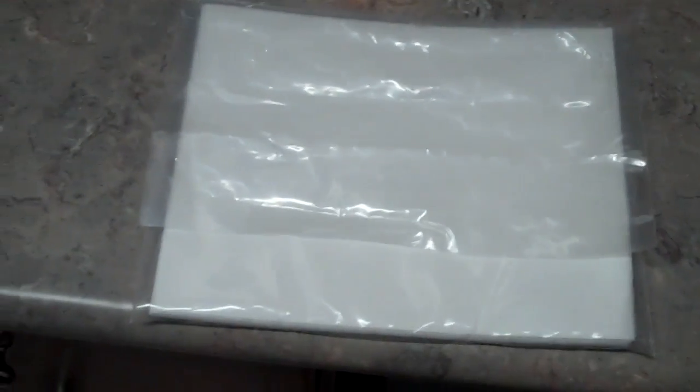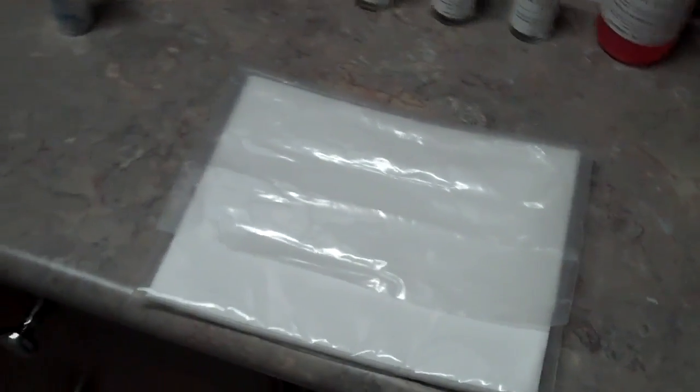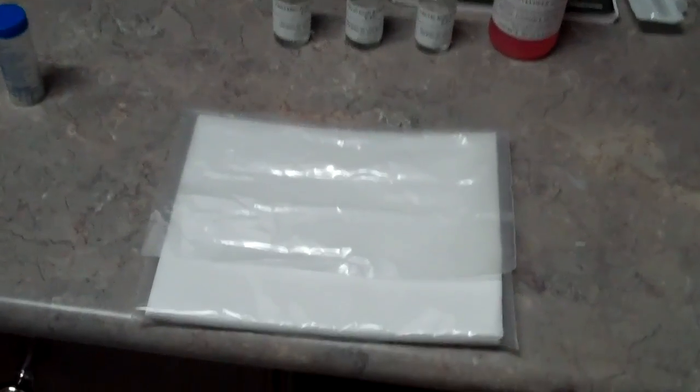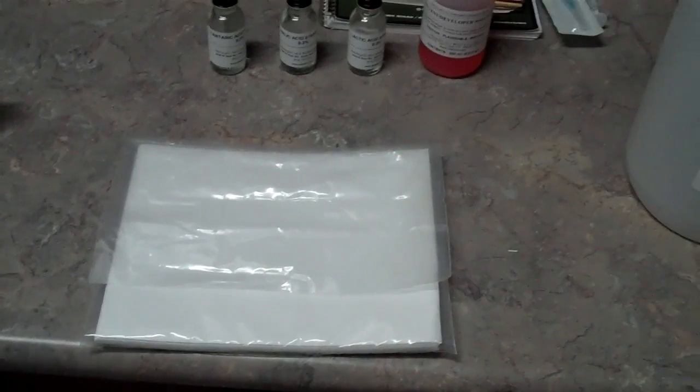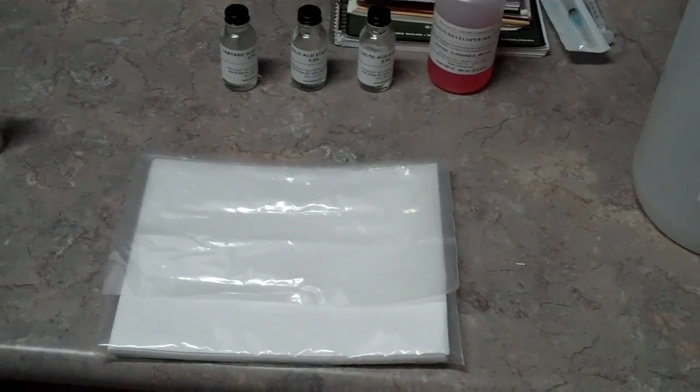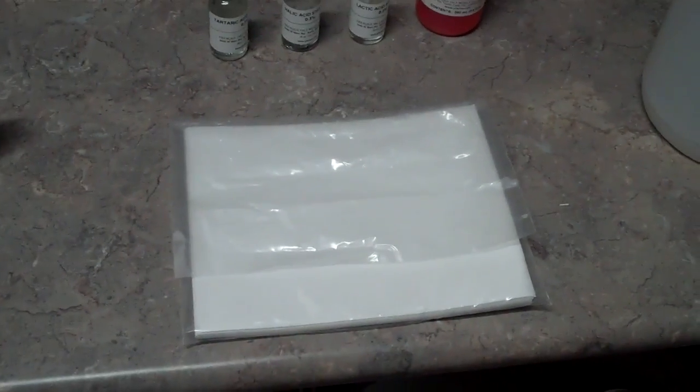My kit came with 30 sheets of paper. Some kits from some places only come with 10. I chose to purchase my kit from piwine.com because it came with 30 actual chromatography pages and I felt that the value was great for what I was getting.